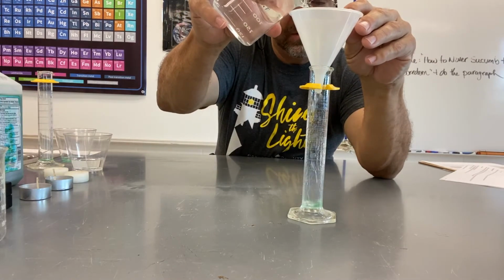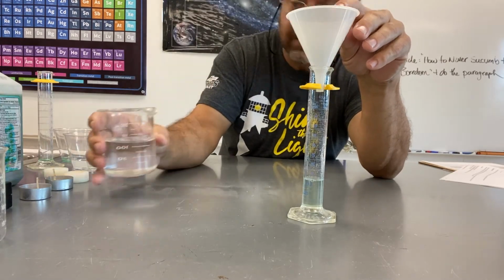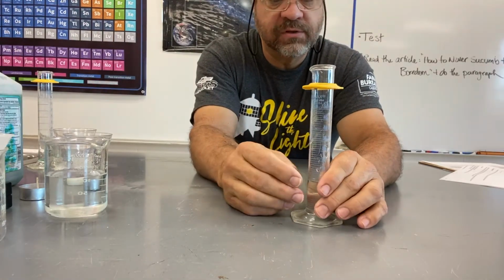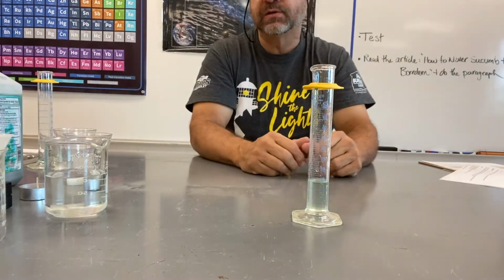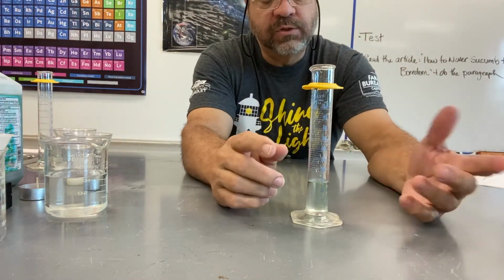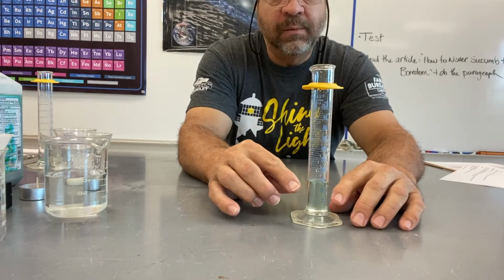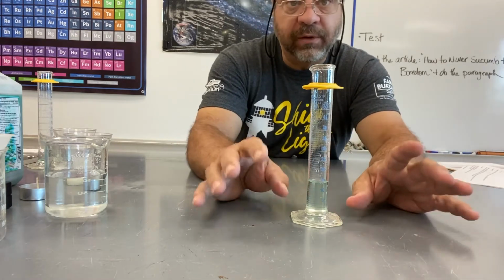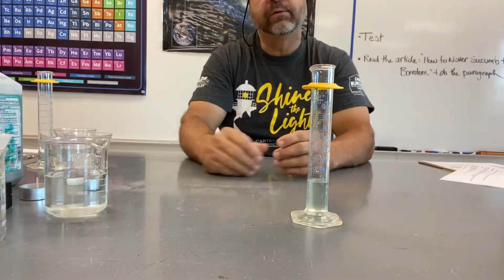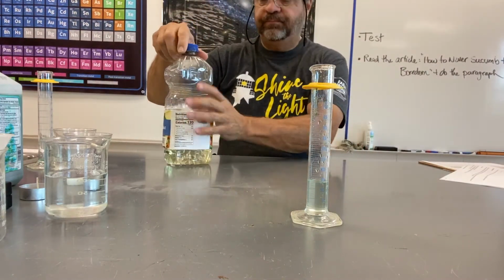I'm gonna put about 15 milliliters of water in there. And we're not gonna be weighing this or doing any intricate measurements, so it's okay. I'm not having to worry about the meniscus so much. If we were trying to find the actual density of the liquid, which we're gonna do in just a couple minutes, but not with this setup, then I'd have to really be hitting that meniscus so I know exactly how much I have. So I'm comparing apples to apples when I do that. But this is going to be more of a layering process here, so I'm not worried as much about that. All right, so I've got water in there.